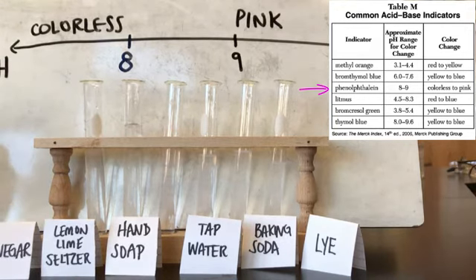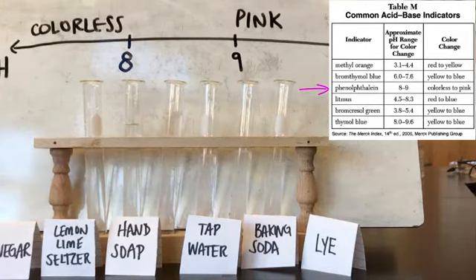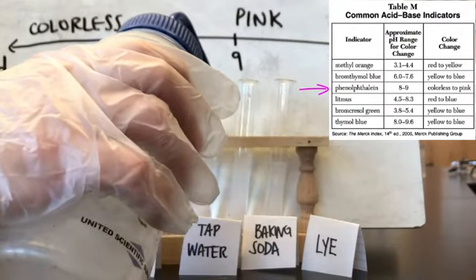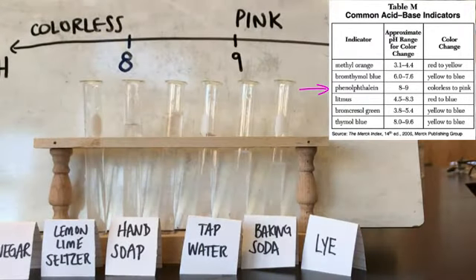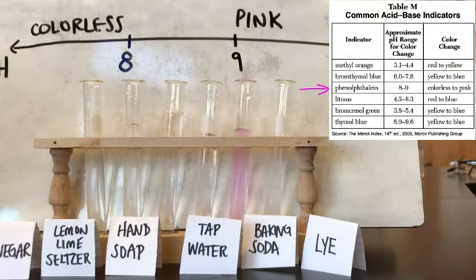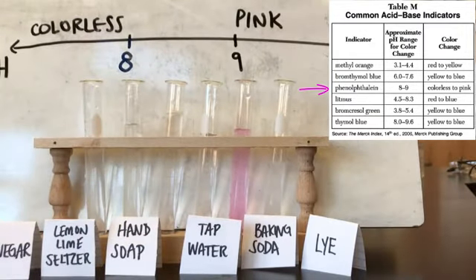Hand soap stays clear. Tap water stays clear. Baking soda. I see a pink color for baking soda. And finally our lye.